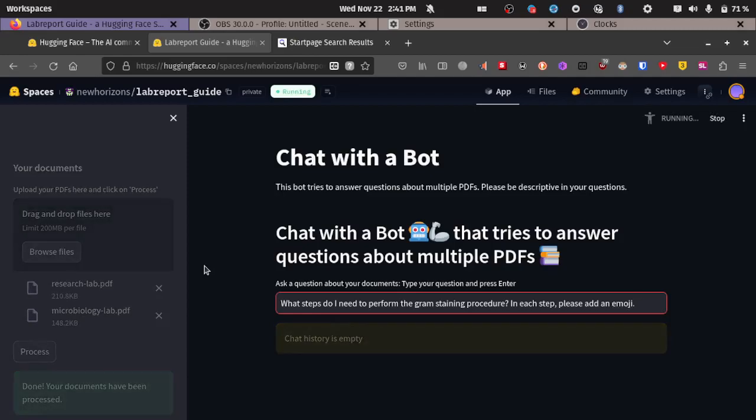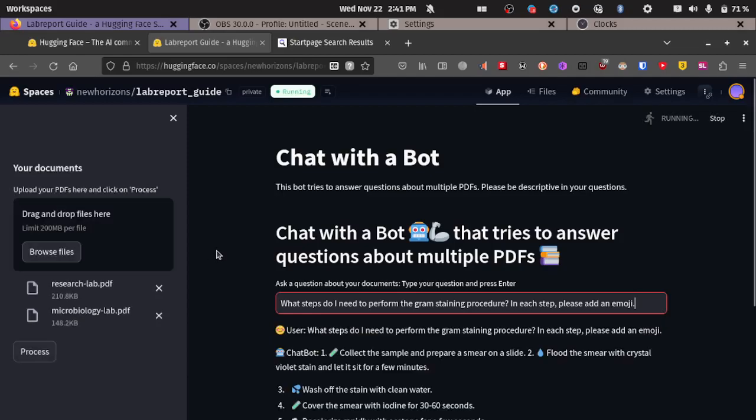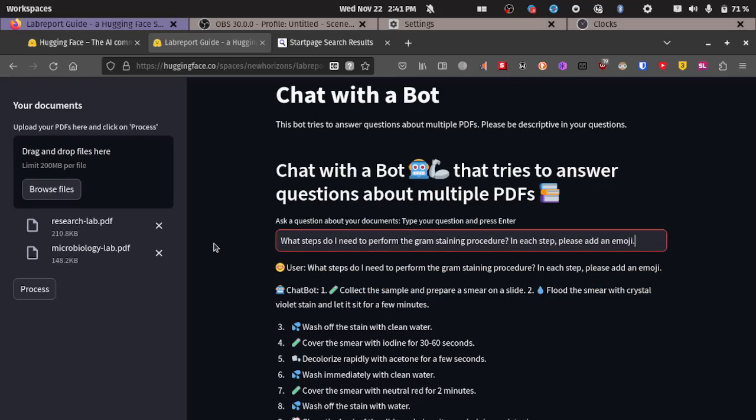What's going to happen is this text will be turned into a bunch of numbers. In the background, whatever text is in this document is also going to be made into a representation, which is called an embedding. Your text is converted into numbers, and this is stored in a particular database called a vector store. Within that vector store, we do something called similarity search.